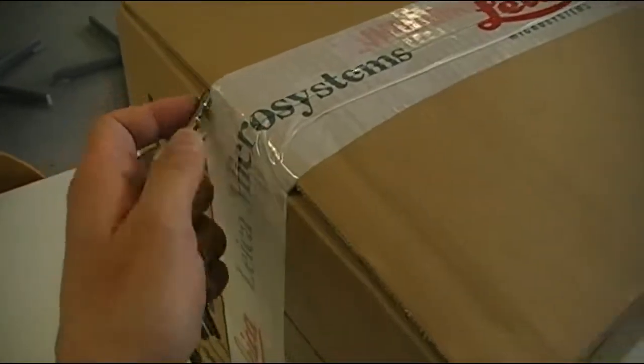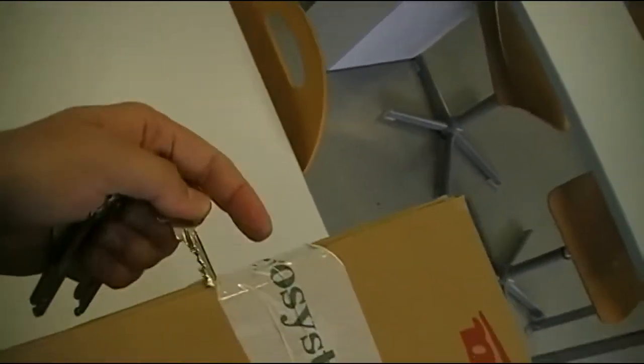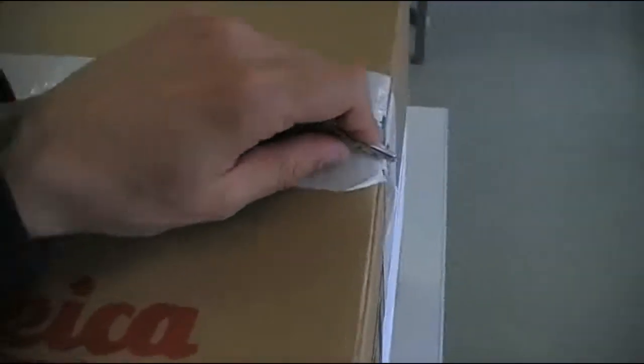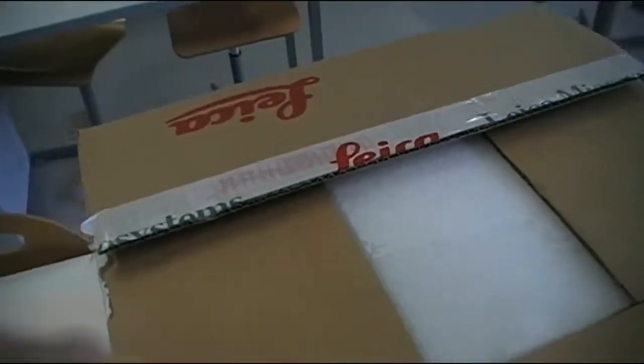Unfortunately I do not have a tripod with me right now so it's going to be a little bit shaky. Okay, let's see what we have in here. I may have to put it on the floor otherwise it's a little bit difficult to see. Okay, packed nicely in foam, let's remove the lid.